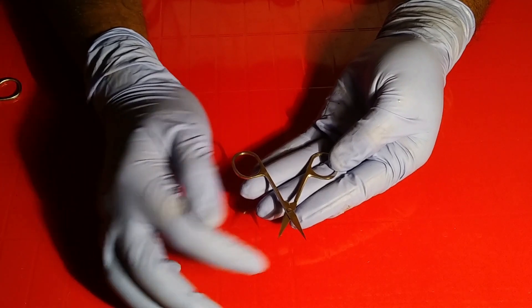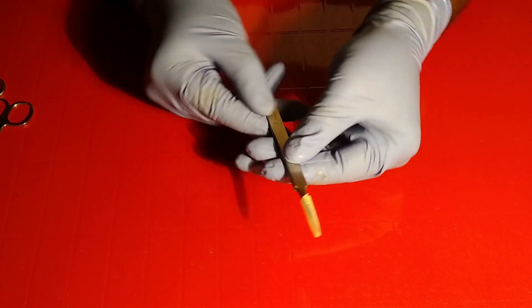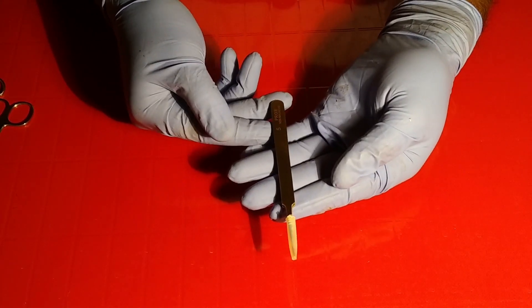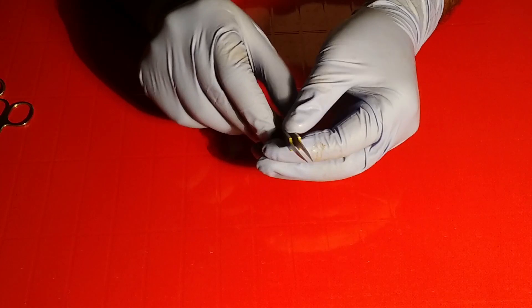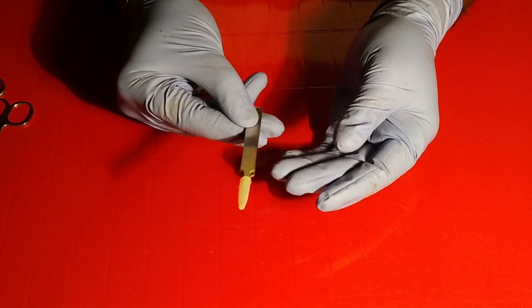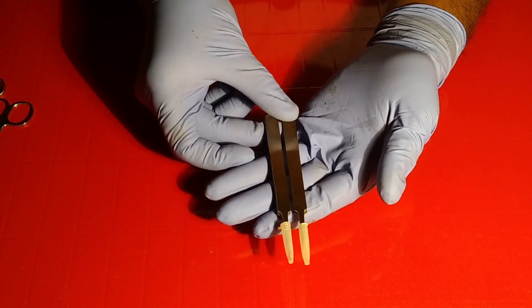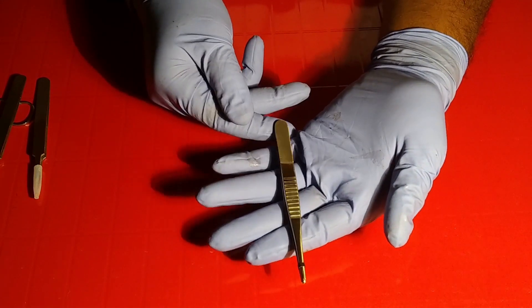The invertebrate scissor is used for minute practicals like dissecting the head nervous system of invertebrates. This particular forceps is the watchmaker forceps — look at the tip. While choosing watchmaker forceps, be comfortable with them, as selection of instruments is very important.